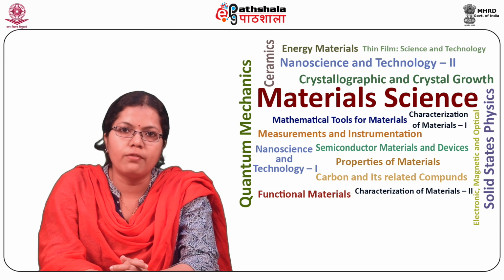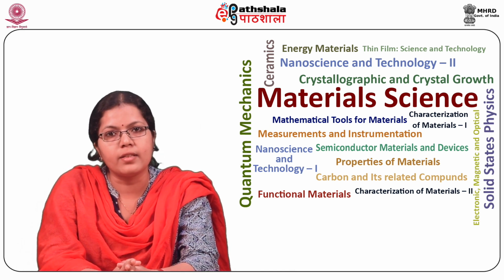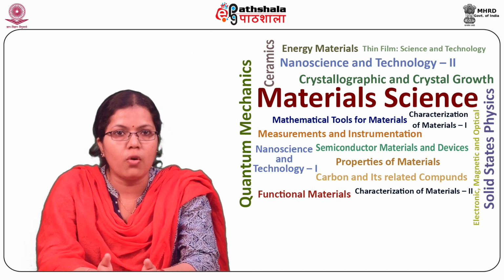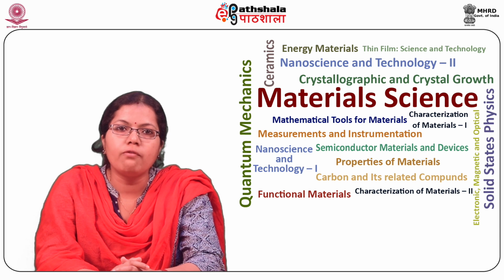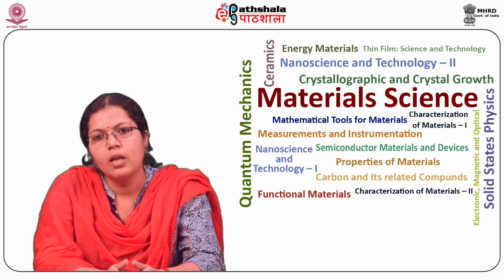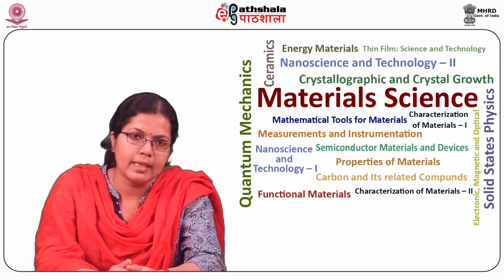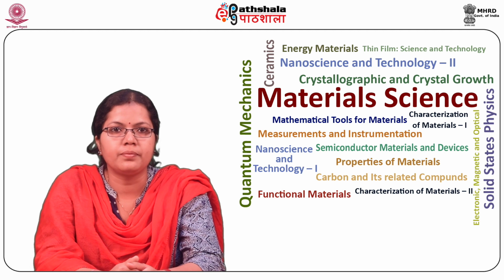The basic components of the transmission electron microscope are the electron source, that is the electron gun, with associated accelerating facility for energizing the electrons, a set of lenses, that is the condenser, objective, intermediate, and projector, a fluorescent screen on which the final image is observed, and photographic facilities for recording the images. In addition, there are apertures introduced in the vicinity of the condenser, objective, and intermediate lenses, and a stigmator.